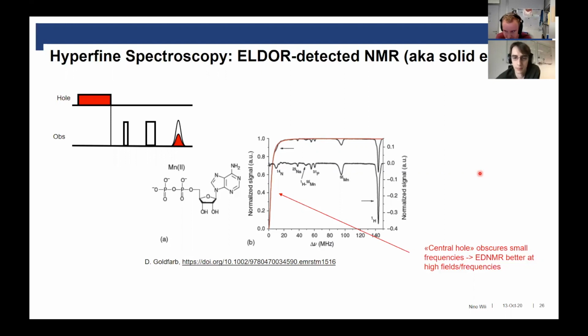But generally, the problem is that RDCs assume that you're in solution, with some alignment media, and usually we do it at 10 to 15 K. So it's just frozen. Nothing actually moves anymore. So I don't think it's used that much, or I don't know that many applications. Okay, thank you.